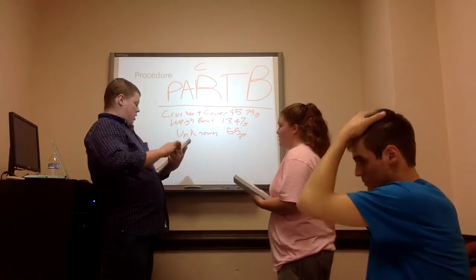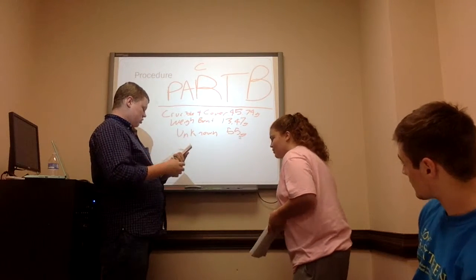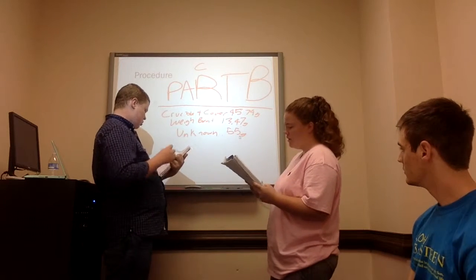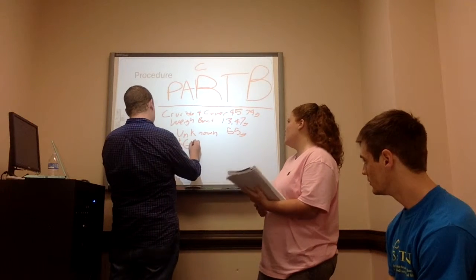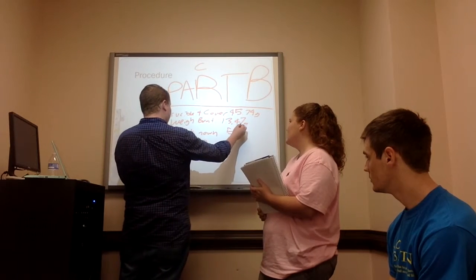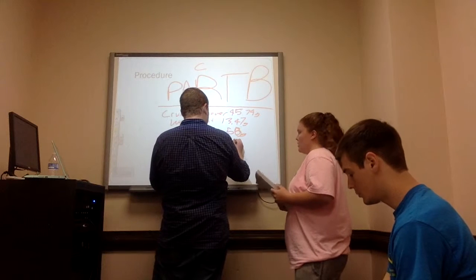Okay. And so, put it with the crucible. Place the crucible and the unknown in it. You weighed it, and you weighed what? 46.32 grams, which means the unknown weighed 0.58 grams. So your original measure was 0.55, but it was 0.58. Yes. So that's crucible and unknown.